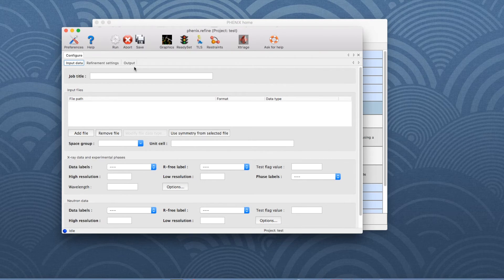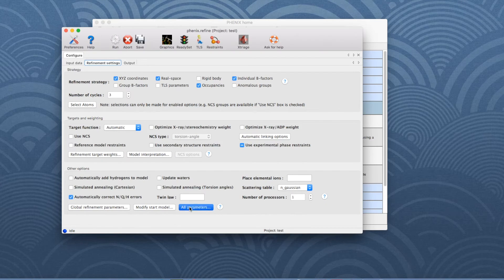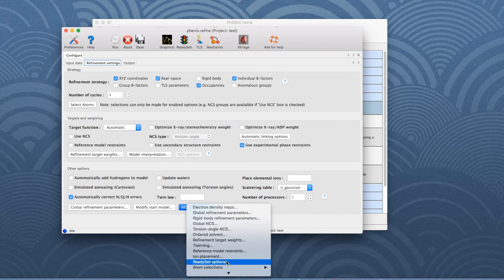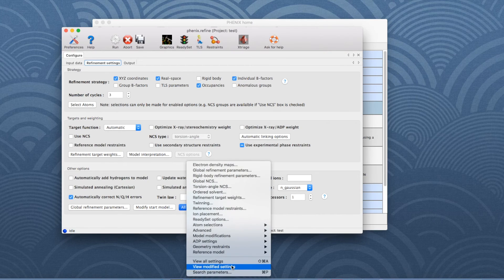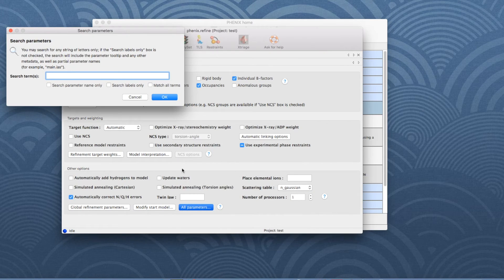Under Configure, go to the Refinement Settings tab. In the Other Options field at the bottom, click on All Parameters. In the drop-down menu, choose Search Parameters, which is on the bottom of the list.